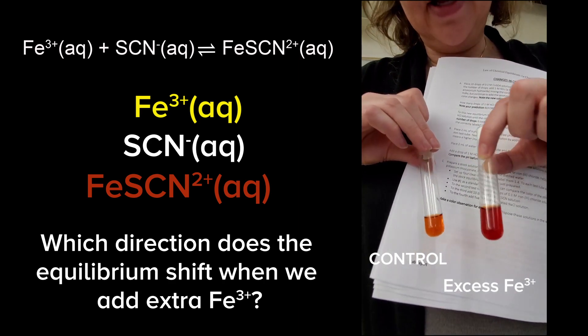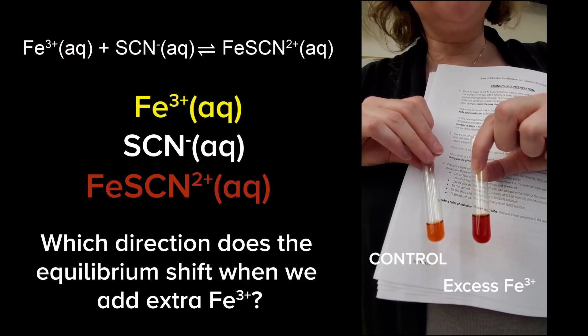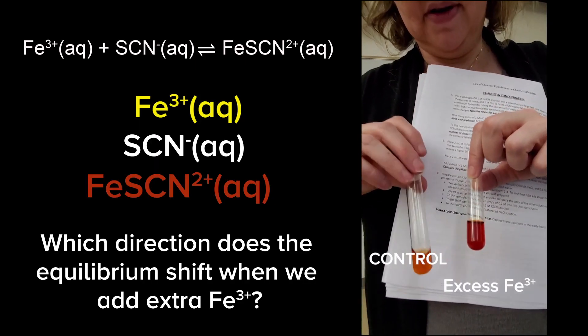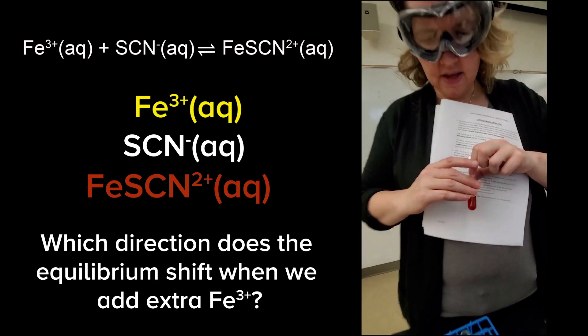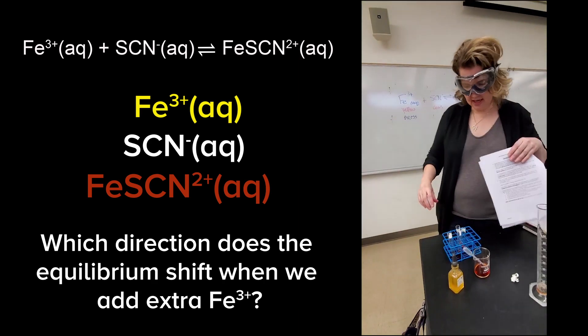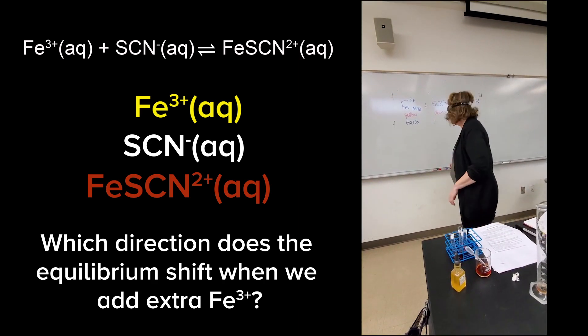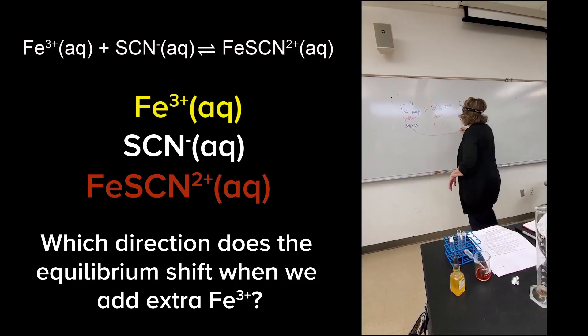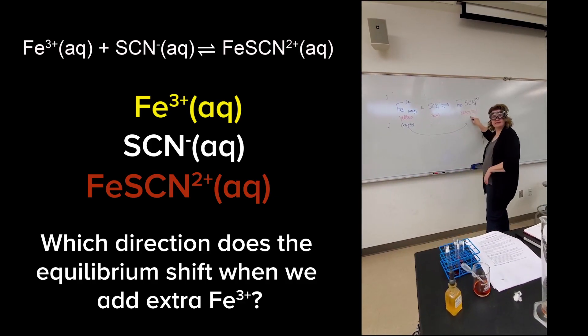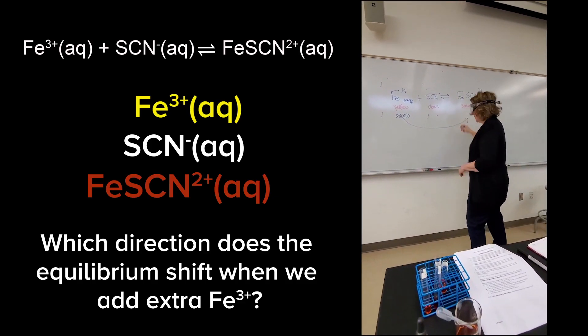So is it clear to you that we're getting more of the complex ion there? We had a shift? It does seem to be darker on the right side. Okay. So that resulted in a shift to the right because this color got darker.